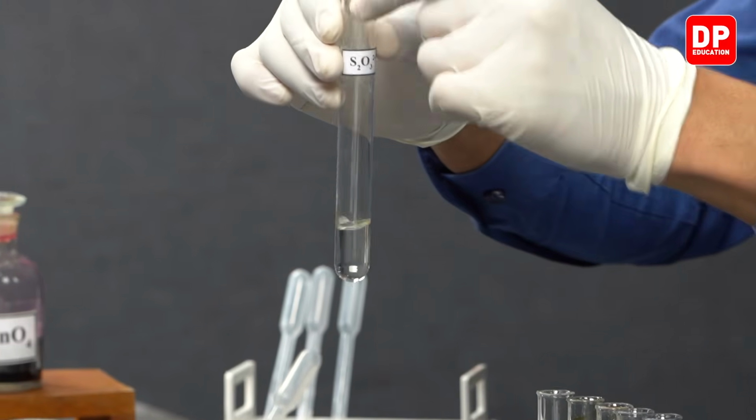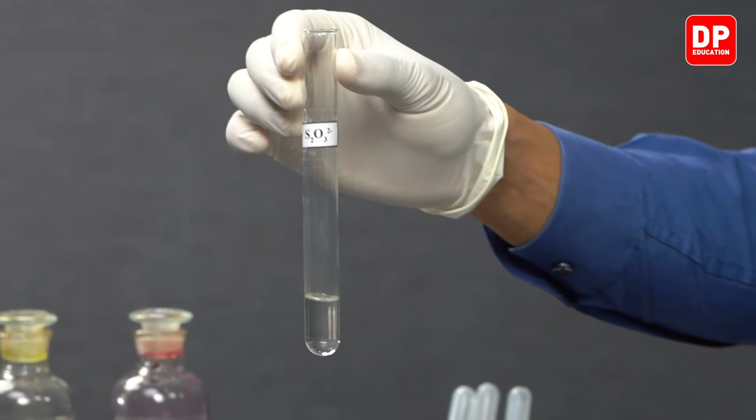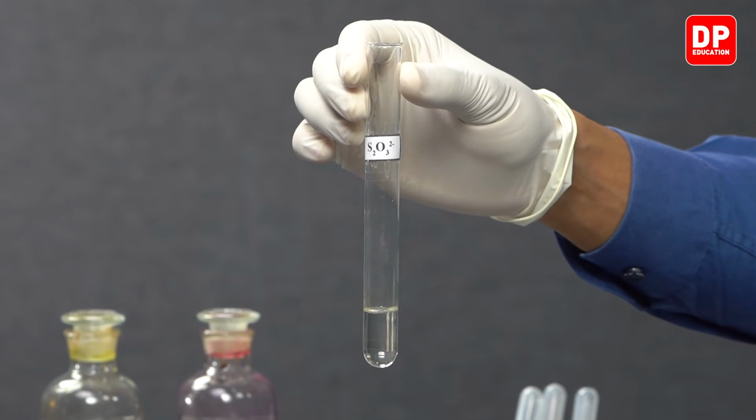We have a clear solution of thiosulfate ion solution here, and to this we will be adding hydrochloric acid, HCl.